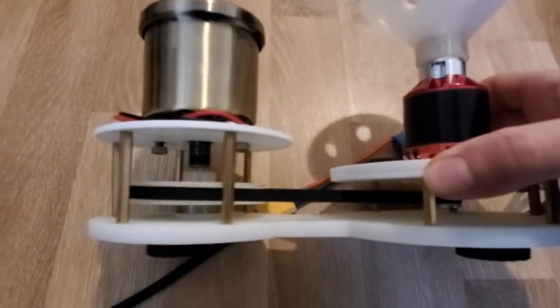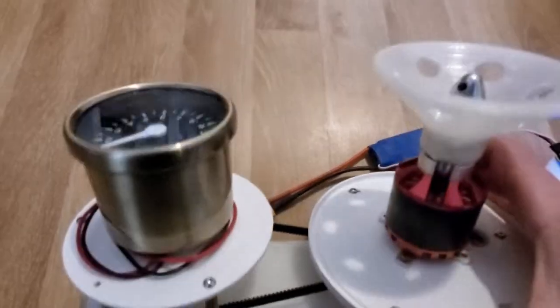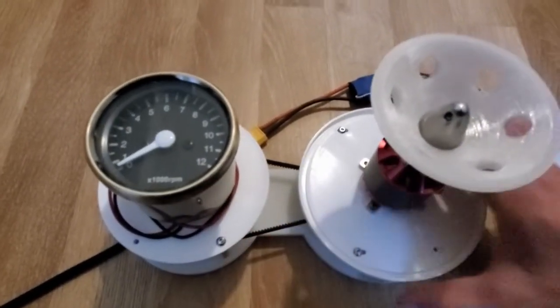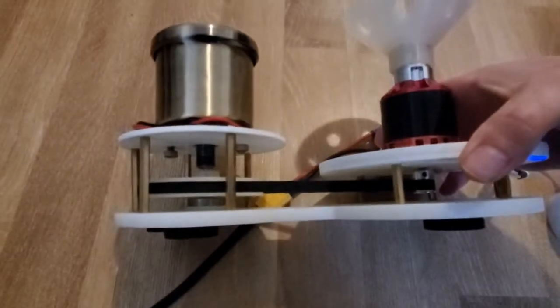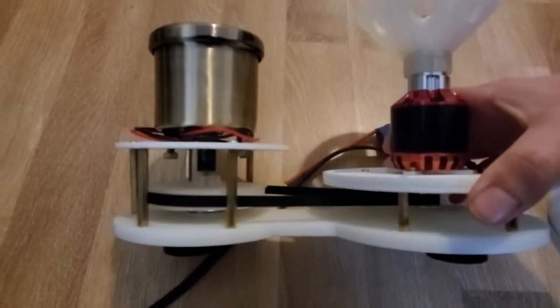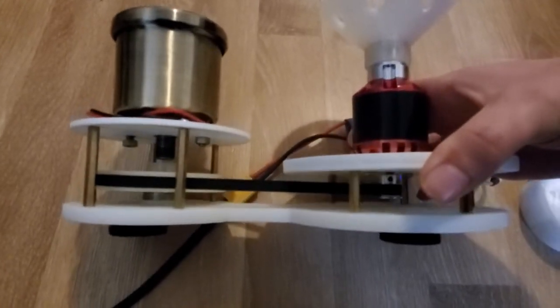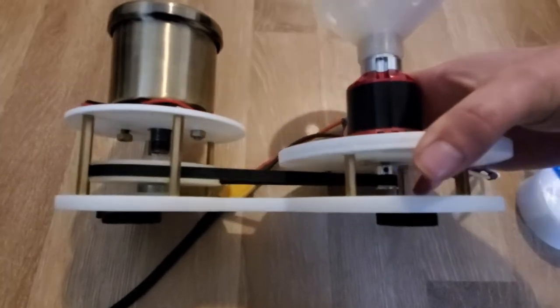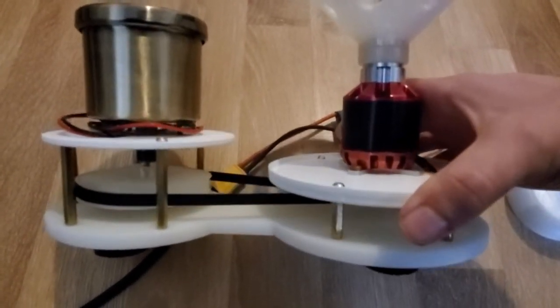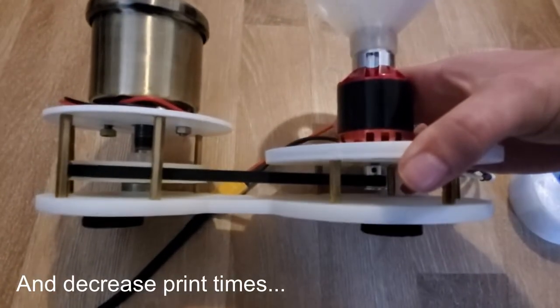I also chose to 3D print all the pieces separately this time, so that the motor holder, speedo holder, and the base plate are actually separate, and they're connected with these electronic standoffs. Part of the reason for that was to increase the stability and also make it possible for me to 3D print the parts better and make assembly easier at the same time.